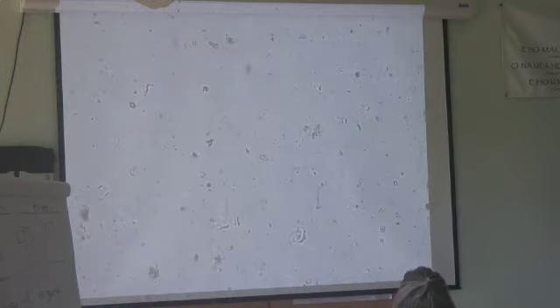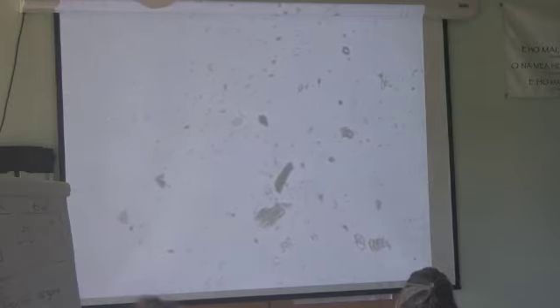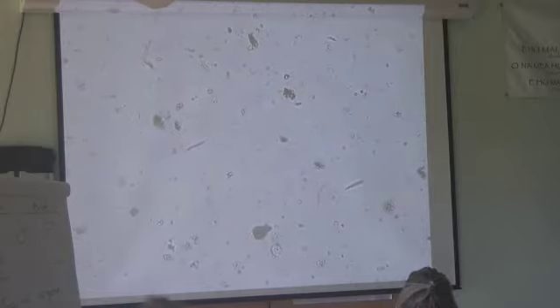That's super. You can see those, and another one here. So your pineapple field has recently been in forest. And testate amoebae, so there's another one. Testate amoebae are known to prefer old-world forest soil. Old growth forests, so you know they tend to have to be a couple hundred years old for them to be called old growth.